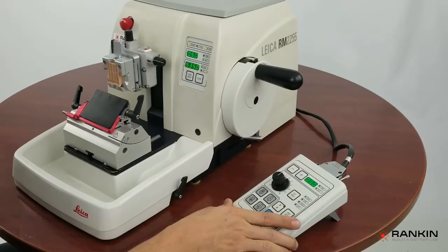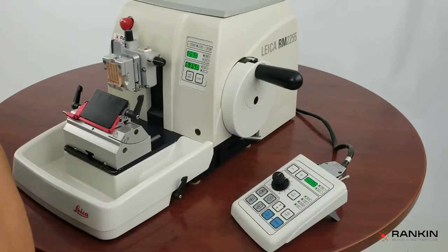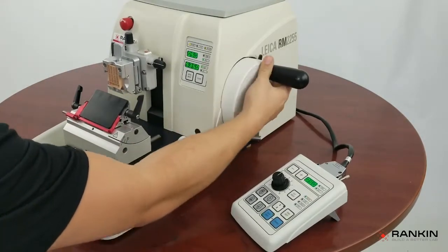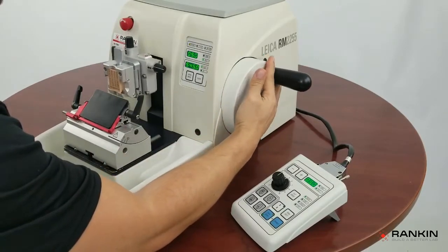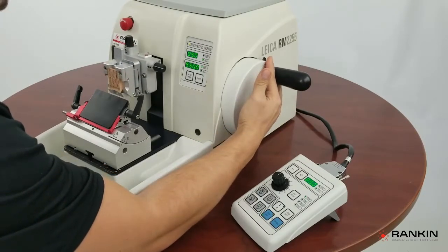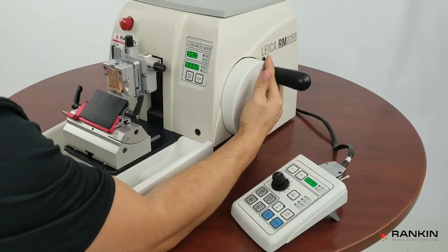We'll start with rock. Rock is a manual feature of this microtome where a technician might not want to come all the way through with a full rotation of the handwheel — they would rather rock it. So every time the handwheel moves from the forward position, it will advance, and every time you move it in the back position, it will retract.